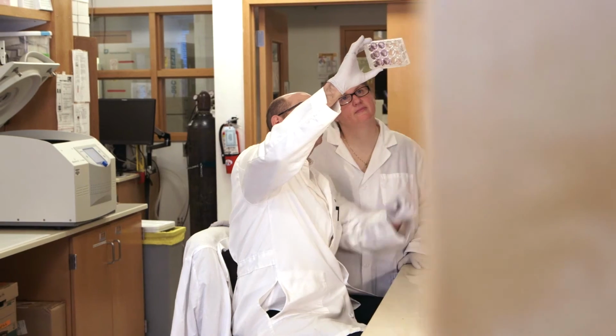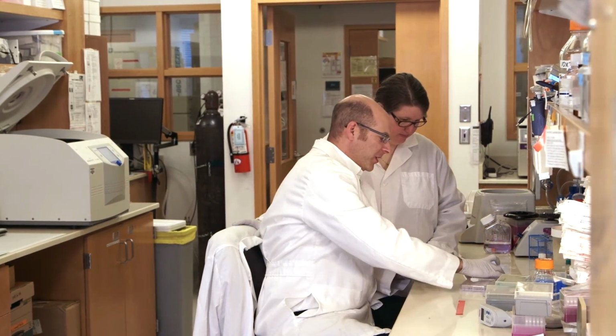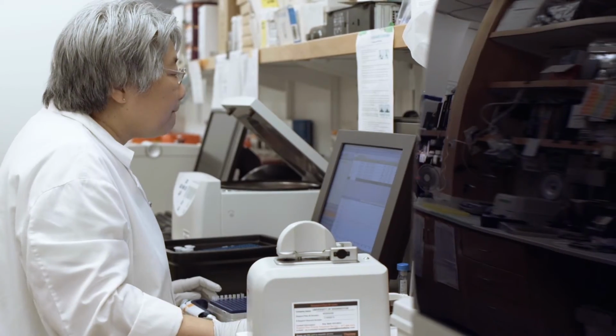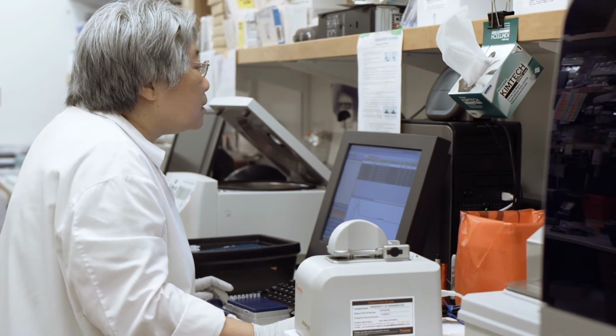We tend here to do things that are not standard. We have standard pipelines and protocols in place. We have standard RNA-seq procedures, but we break the protocols. We don't make adequate libraries. We may get different cluster sizes, and they're very helpful with that. They know that their instrument and their chemistry really gets developed a lot by the user, and that's how the new ideas come about.